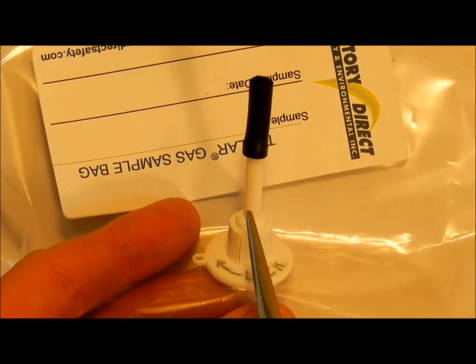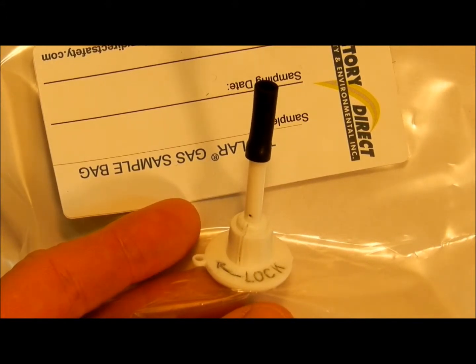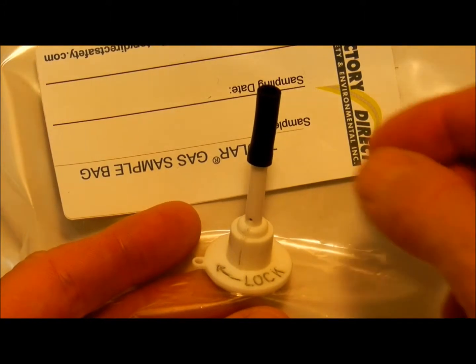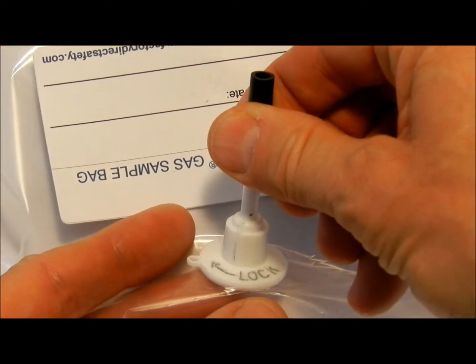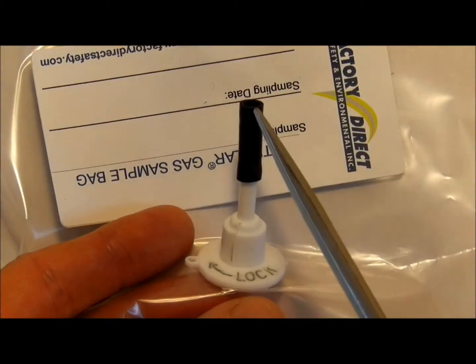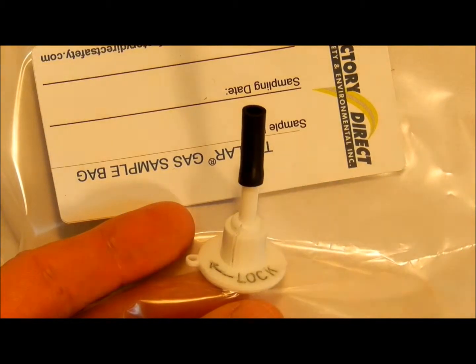This valve, with the small dot lined with the lines on the side of the valve, is currently in the closed position. To open the valve, grasp the stem, rotate counterclockwise slightly and push in. This opens the valve allowing gas to flow from the inside to the outside of the bag or vice versa.